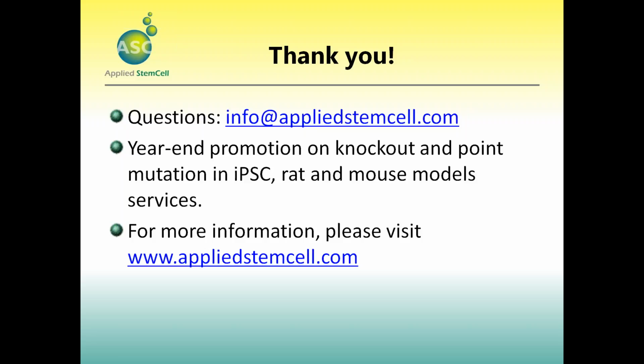Okay, the next question is what QC steps are involved after gene modification in iPS cells? QC steps are very important, so I like this question. There are usually two types of QC steps, one of which is generally for all gene editing using CRISPR. That is the off-target profile. So we check the off-target profile as a standard procedure for all iPS cell gene editing and other cell line or animal gene editing.